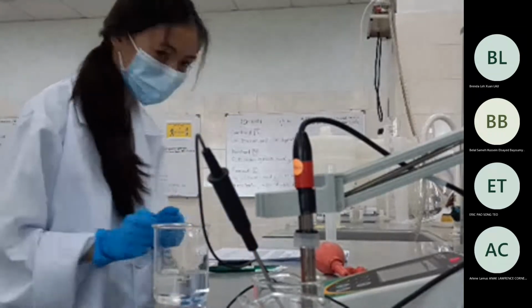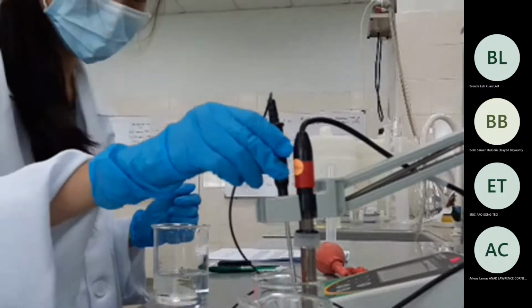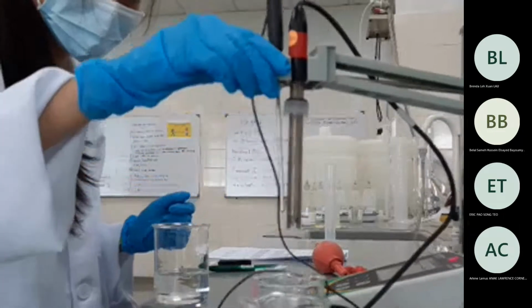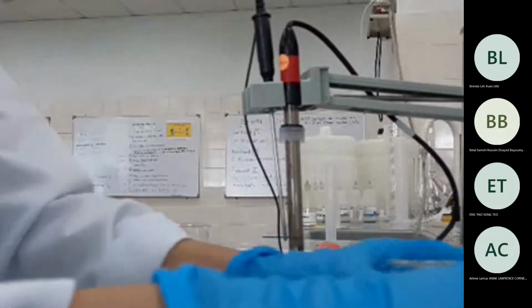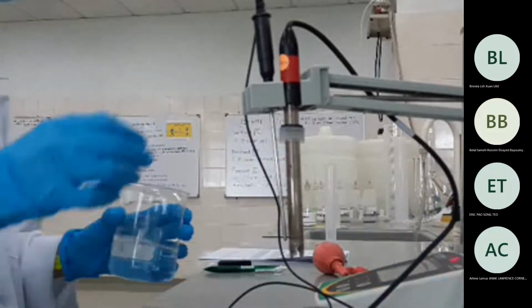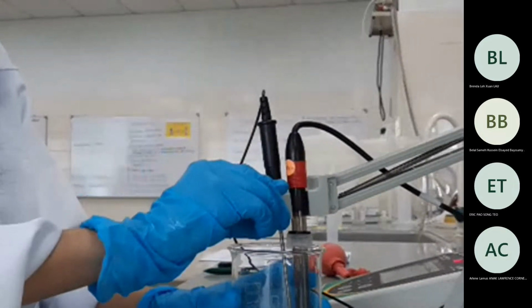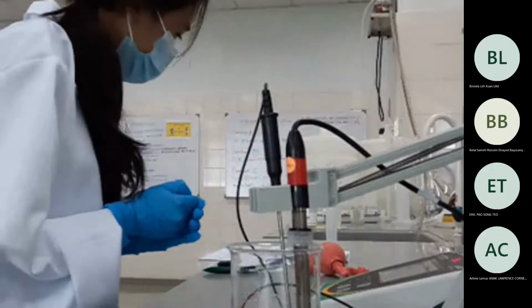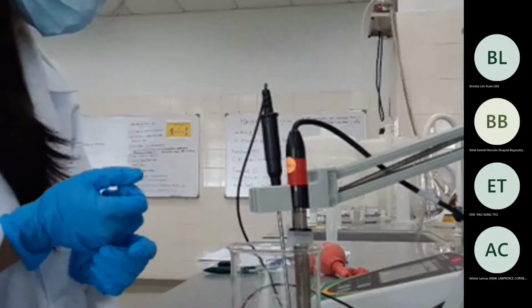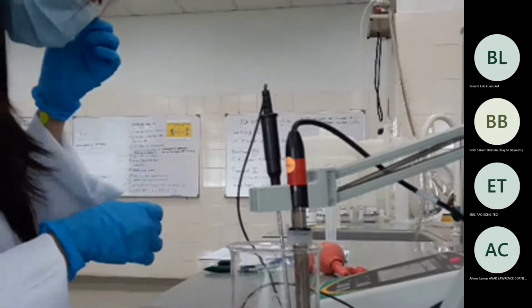Yeah, so now you can take the pH of this buffer. No, just one is the same, right? Same thing, so you don't need to. Have you measured the pH for the buffer? Not the 100. Okay, so you don't need to do the 25 again. You just need to add the same way. In one beaker you add 0.1 molar HCl, in another beaker sodium hydroxide. We just want to see the contrast.